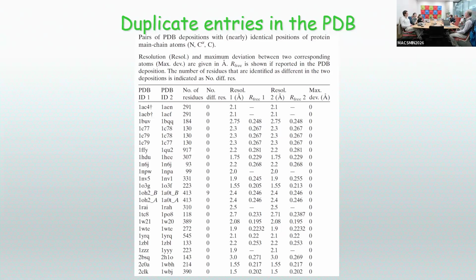And, you know, at one time when I was in the army, we were taught that under battle conditions, cosine can go above 1, but it's only in the military. But occupancy also should not go above 1. And they did some tricks which are simply disallowed tricks. And I know what they were trying to do, but they came up with this duplicate. Now, most other structures here are real duplicates. There are 2 structures with different PDB codes and identical structure. You know, PDB knows about it. That's the good news. PDB did nothing about it. That's the bad news, because all of these other structures should either have been removed or at least somehow marked.